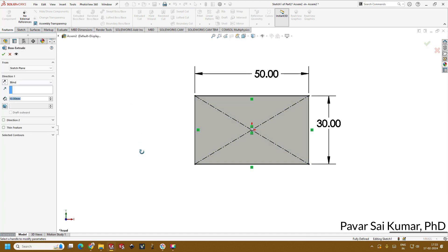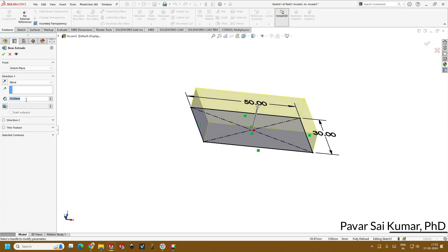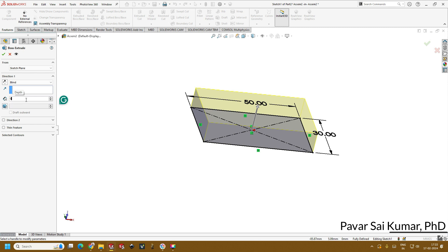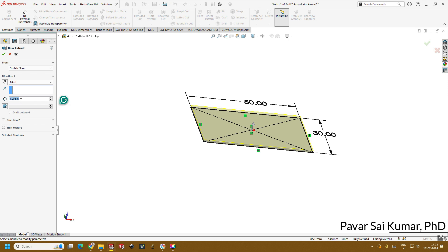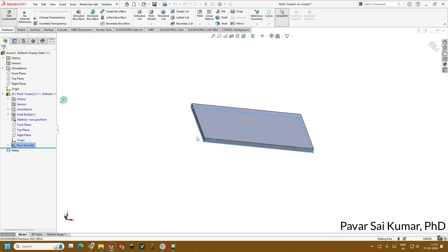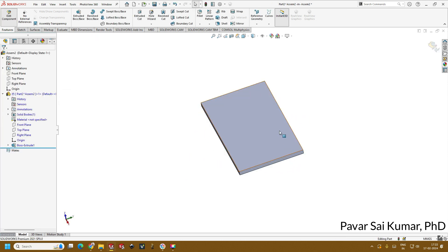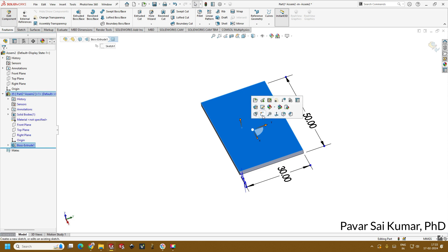Go to features, extrude walls, and give the height or thickness of the device as 2 mm. Click OK. This will create the base for the microfluidic pattern.